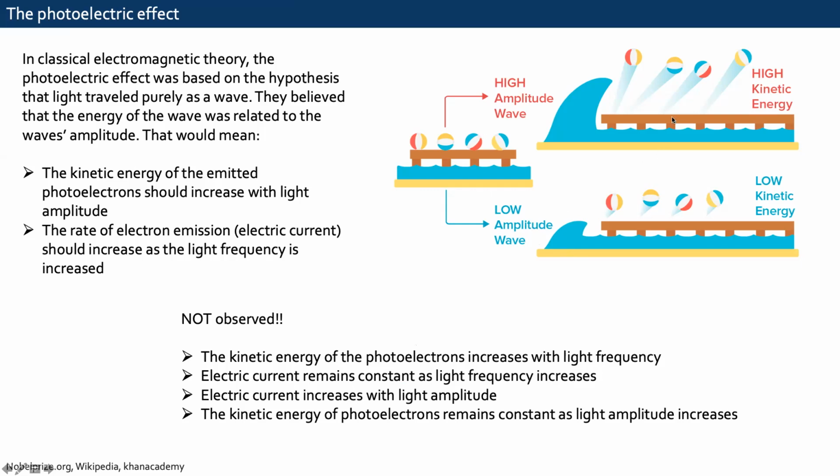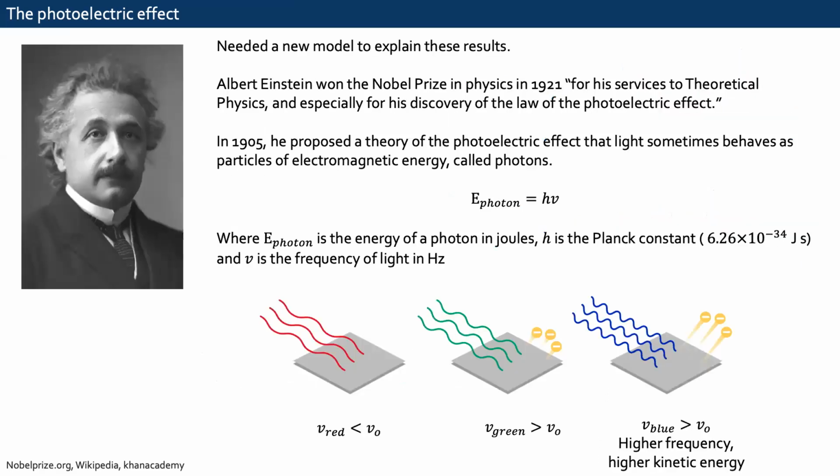So here where we have the high amplitude and we're saying, oh, we get high kinetic energy, that's wrong. If you have a high amplitude, then you get more beach balls kicked off, but not with higher kinetic energy. So we needed a new model to explain these results.